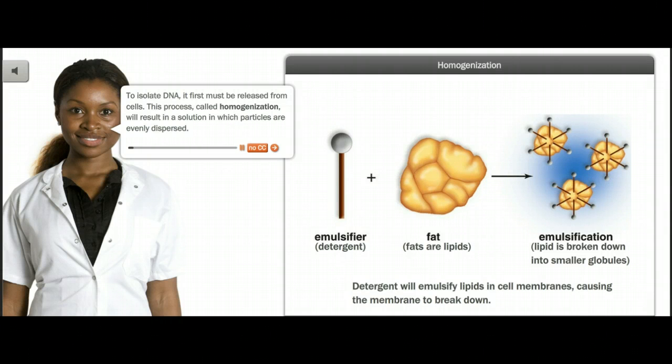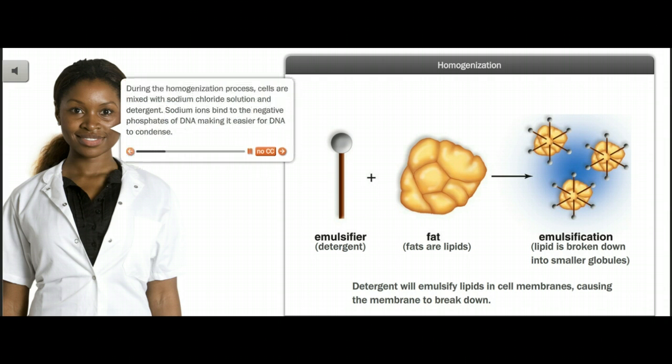To isolate DNA, it first must be released from cells. This process, called homogenization, will result in a solution in which particles are evenly dispersed. During the homogenization process, cells are mixed with sodium chloride solution and detergent. Sodium ions bind to the negative phosphates of DNA, making it easier for DNA to condense.